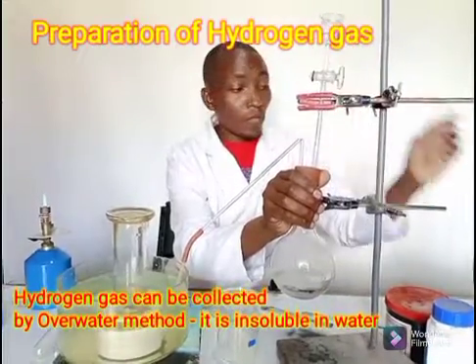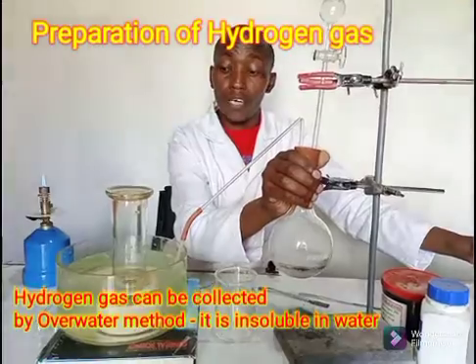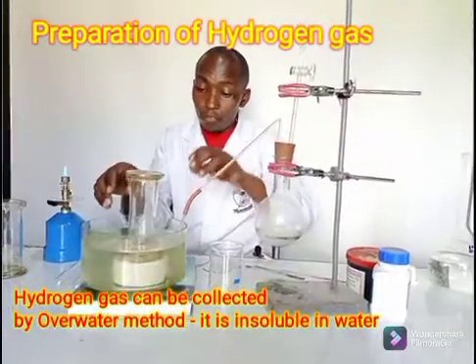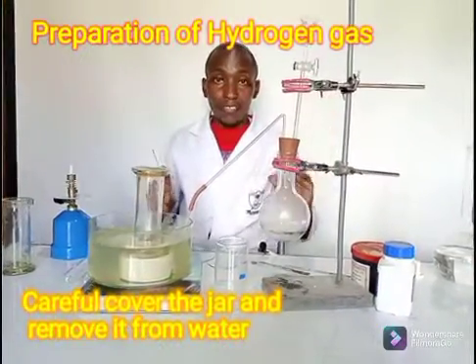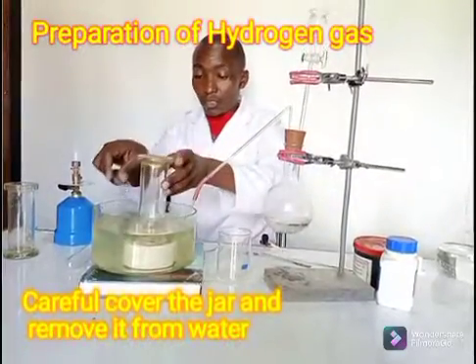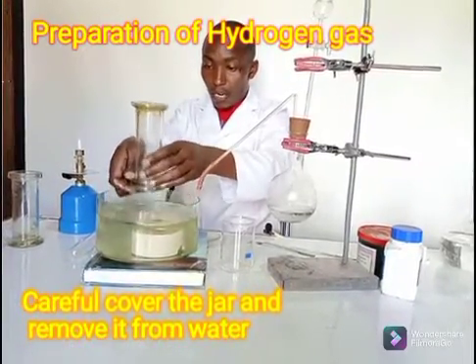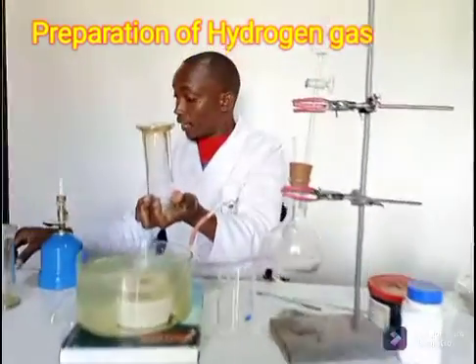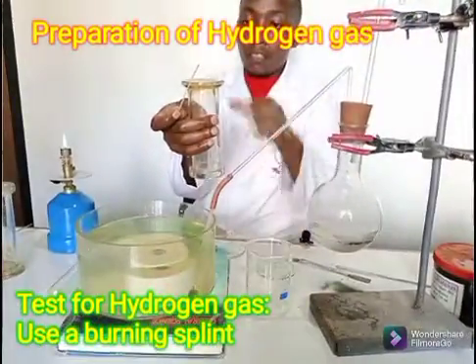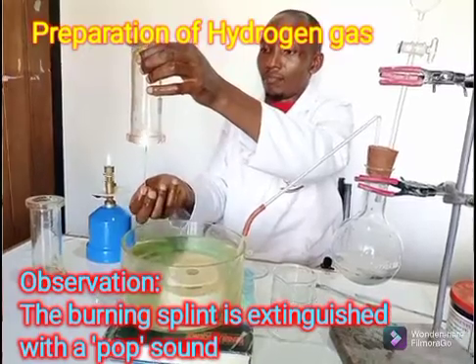My gas jar is almost full. Remember, this method of gas collection we call it the over-water method, and we use it for gases that are insoluble in water, or slightly soluble. My gas jar is full. I only need to be careful with hydrogen — the way to test hydrogen is with a burning splint. I remove the gas jar cover. Remember hydrogen is a very light gas. I hope it does not backfire. So I light a burning splint and lower it in.